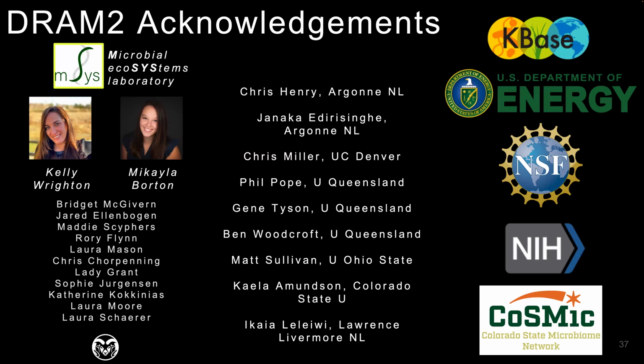And then the last thing: DRAM is a labor of love from a lot of people. It's not just me, it's not just Kelly, it's our whole lab. We have lots of people in our lab who have put a lot of work into this, and we've worked with a lot of people at Argonne, Denver, University of Queensland, Ohio State, and many of the other national labs. I just want to highlight that this is work from everybody, not just my lab or Kelly's lab.